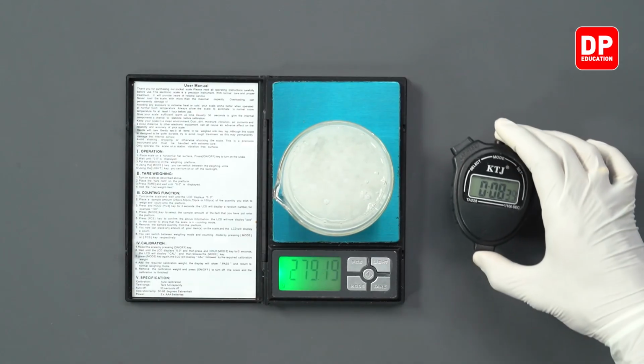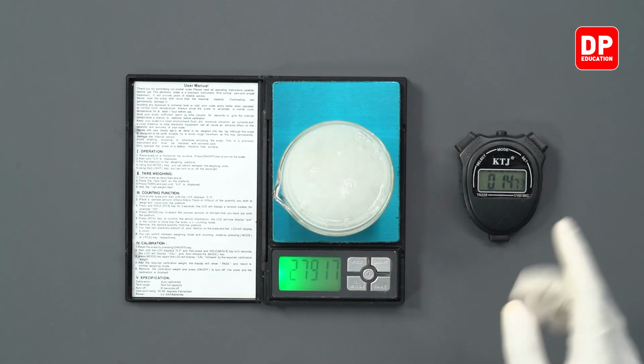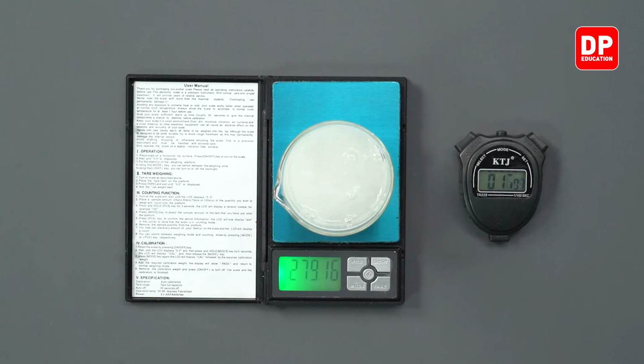Every 20 seconds we will be taking our mass reading over here. You can see carbon dioxide is evolved and the mass is changing. At 20 seconds, 279.13.